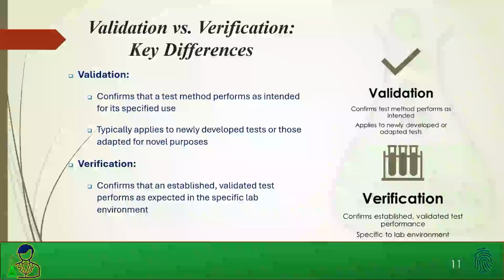There's a criteria and regulatory body that you can do your validation with, you can send them your data, and they'll give a stamp of approval that your study is rigorous enough and meets the regulations to be deemed a verified test. But for the most part, typically in the market, it's an FDA approved test.